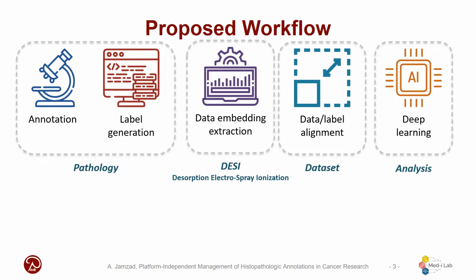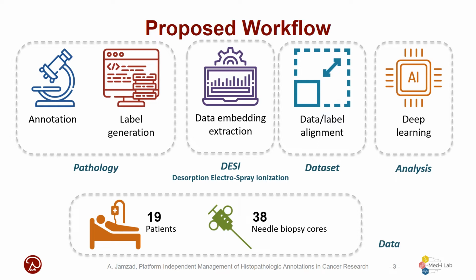The method is tested for prostate cancer grading using DESI mass spec imaging, which measures thousands of low molecular weight chemicals at 50 micron resolution. Our dataset consists of 38 needle biopsy cores from 19 patients, sampled from radical prostatectomies, and cryosectioned into microscopic slides.